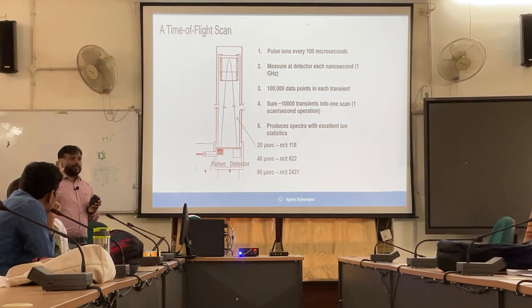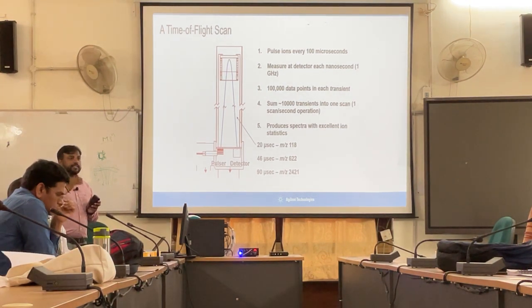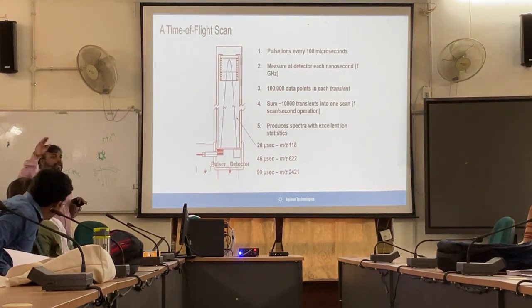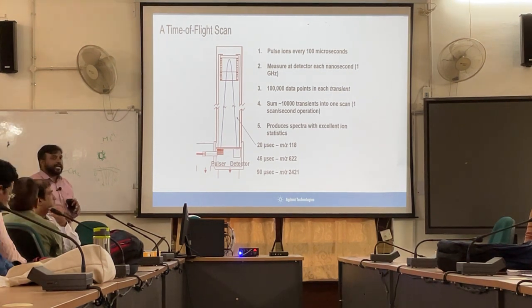In case you are going with 10 kDa, like 10,000 mass size, then this mass is going to be extrapolated. So the time it takes for the 2700 is going to be manipulated, extrapolated with the time, so that it can accurately get the higher mass results also.